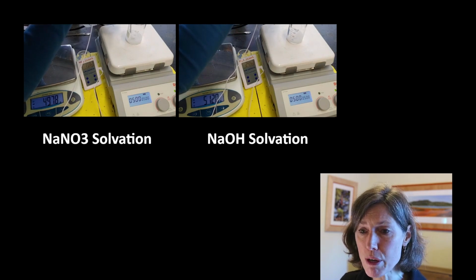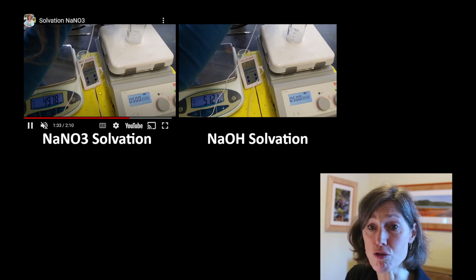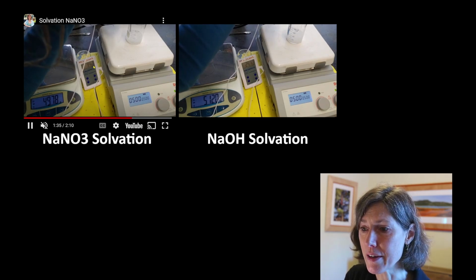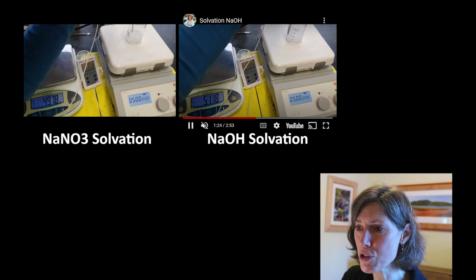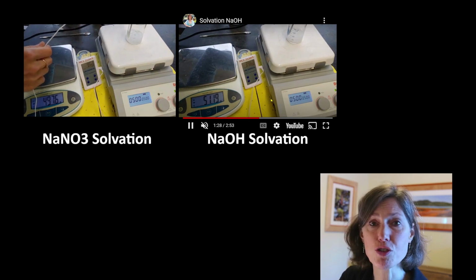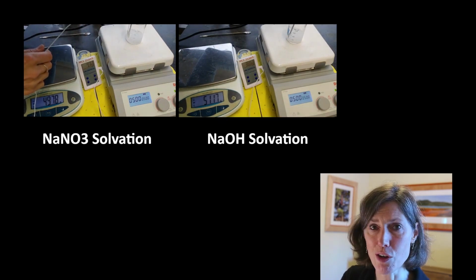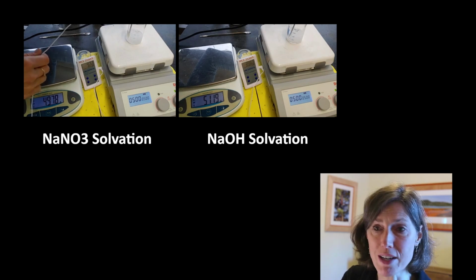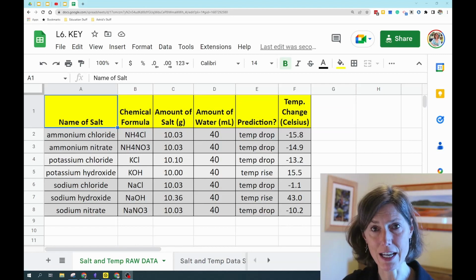So for sodium nitrate, you can clearly see that the temperature is dropping significantly. For the sodium hydroxide, as you can see here, a little bit more slowly, it's going to start to rise and rise. So these 2 extremes were really powerful. And again, we're thinking here about, are all bonds the same? Now we are ready to actually analyze the data.